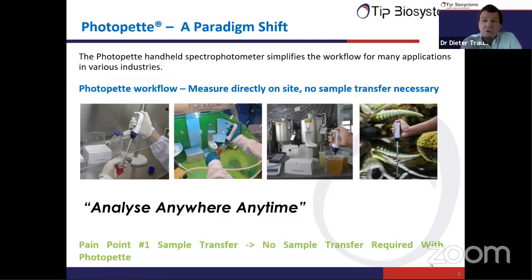And there's also no sample transfer into another container, such as the cuvette, because the device itself contains its own cuvette.